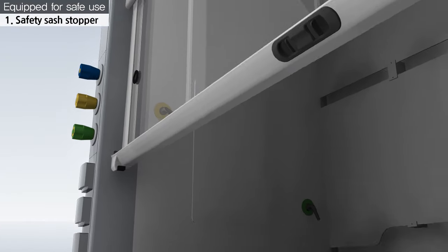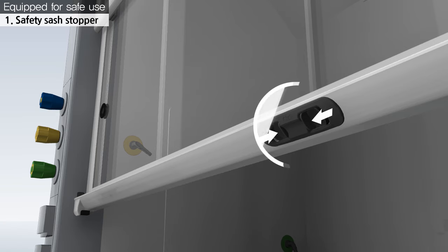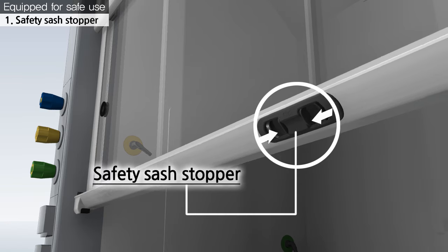With a safety sash stopper at the bottom of the front door, the door opening can be adjusted to over 500 millimeters.